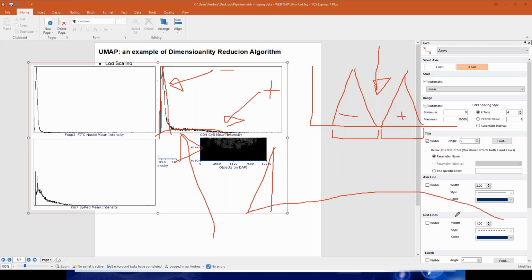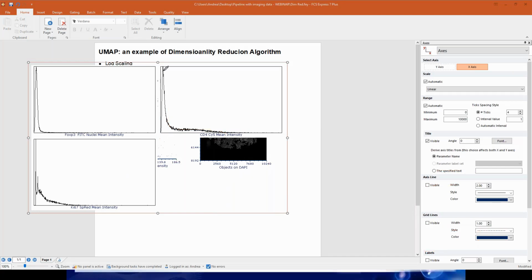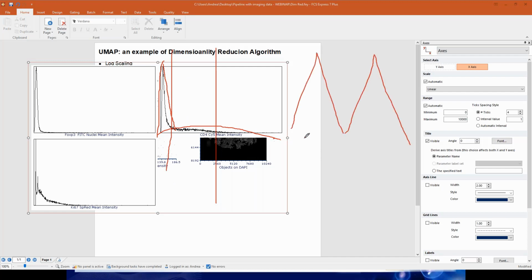So if you see something like this, what is the positive, what is the negative? Maybe the positive is this one, maybe the positive is all of these. So it's really less easy to do that. And it's even less easy if you are not a human and you are an algorithm. If you have something like this and you say divide it by 2, it will probably divide it this way. Why, instead, do you want to divide it this way? If you make those peaks more comparable, the algorithm will benefit from that. Most algorithms will benefit.